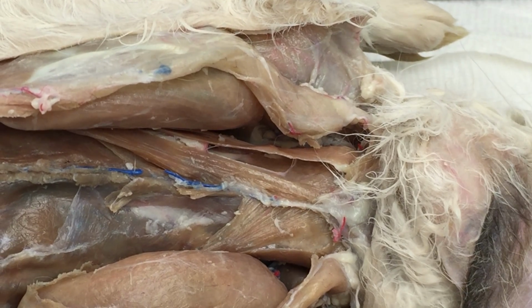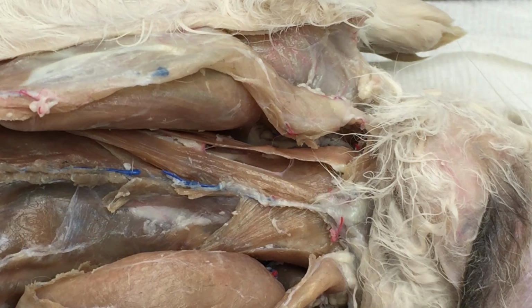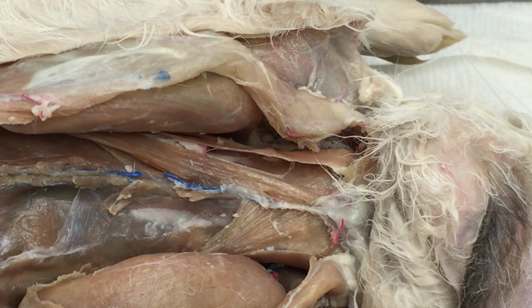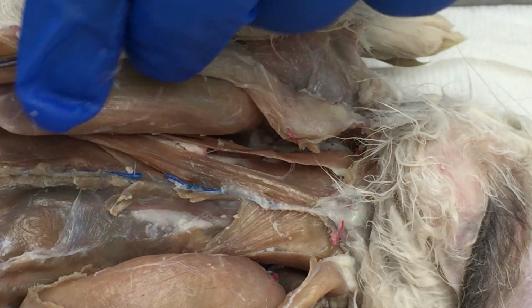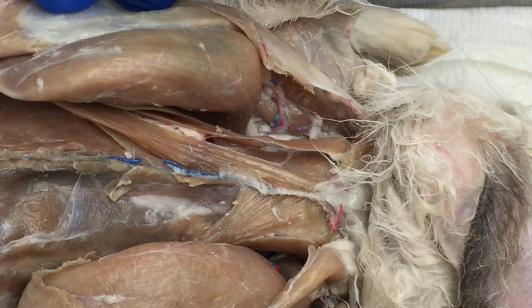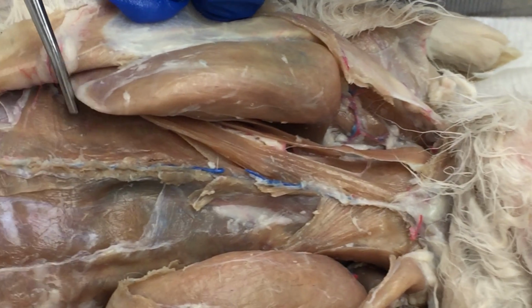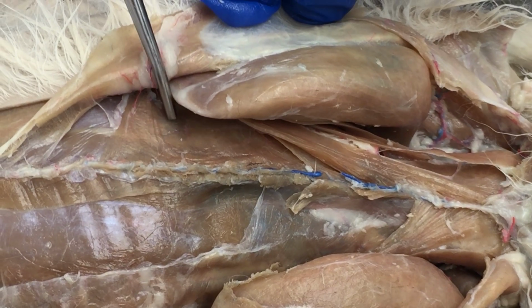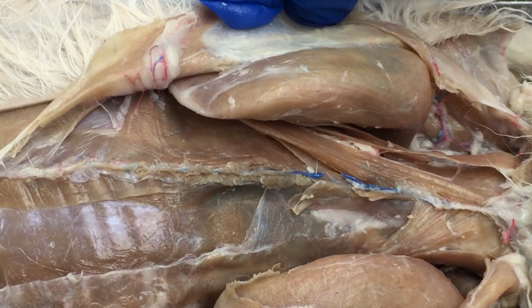Okay, so one of the issues when we look at the rabbit, which is not fixed in anatomical position, is the muscles that move the scapula. So we just want to review them for you here. So if I peel back trapezius, we can see, and we have to remind ourselves that this is the medial border of the scapula. And so obviously it's rotated out of anatomical position as we would expect to see it in human.